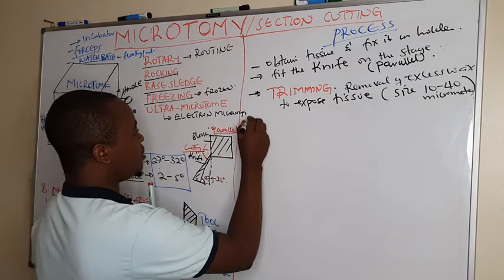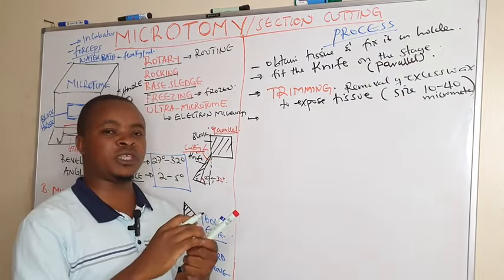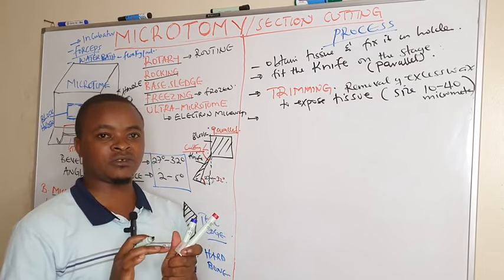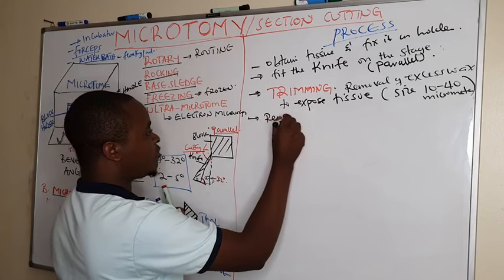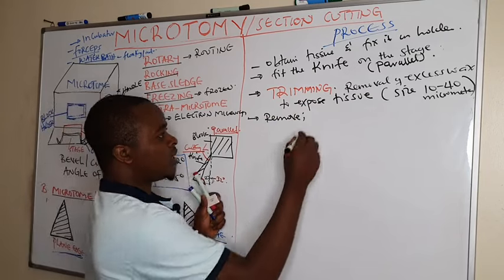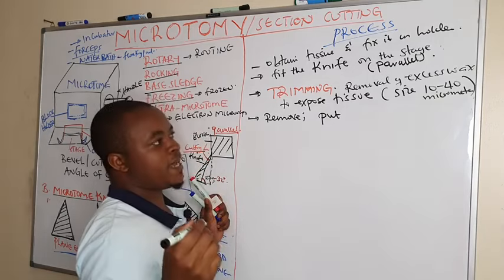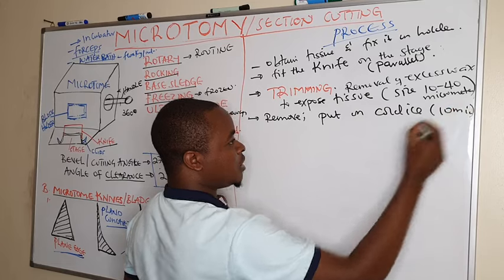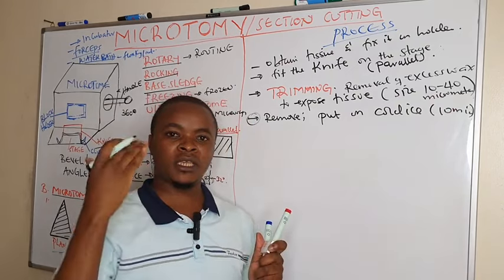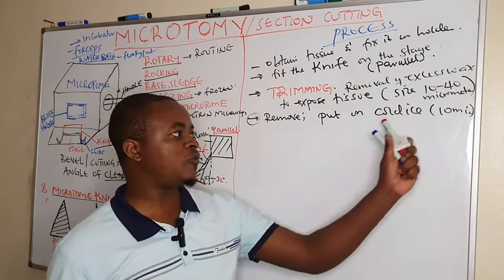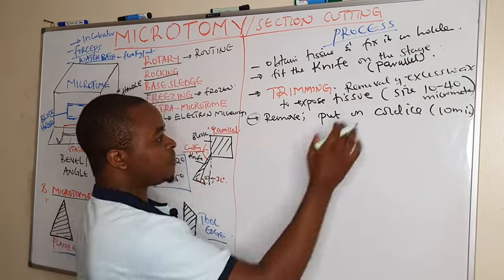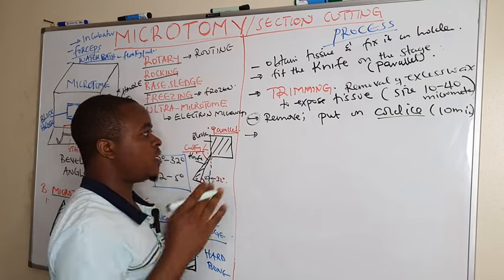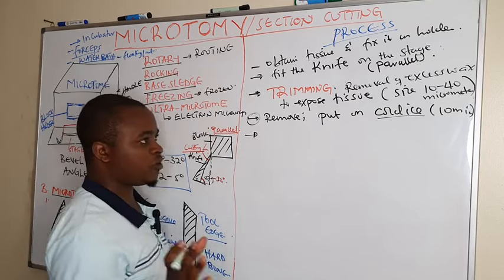After trimming, you remove the block from the holder because trimming causes the surface to heat up, creating inconsistency between the paraffin wax and the tissue. You put the trimmed embedded tissue in cold ice for at least 10 minutes to enable cooling. This step is optional, but it enables easy sectioning to obtain good ribbons.